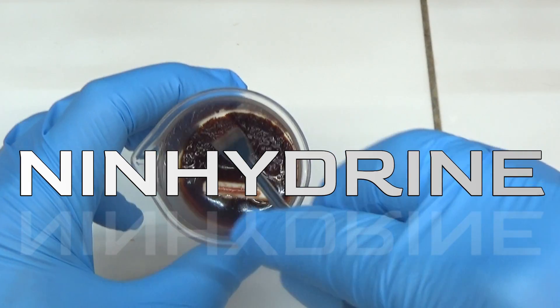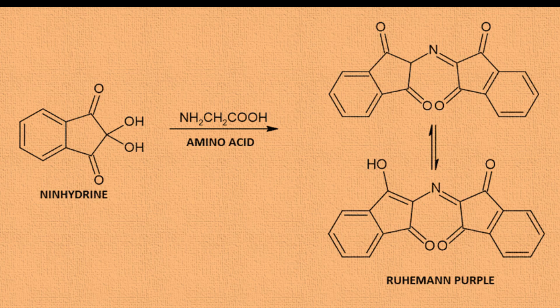In this video, we are going to obtain ninhydrin. Ninhydrin is a reagent used to determine alpha amino acids and reacts with them at pH levels between 4 and 8.